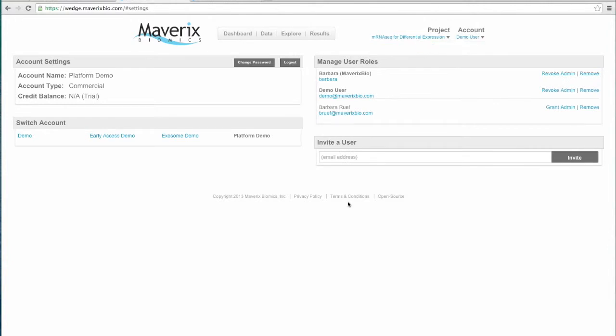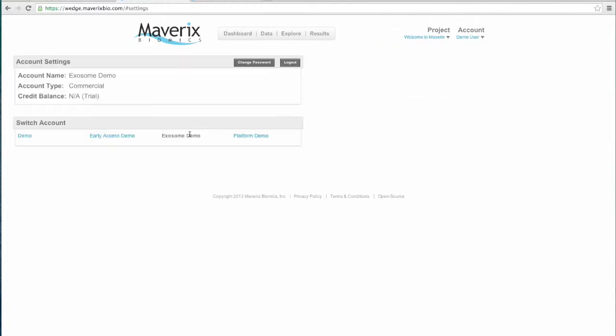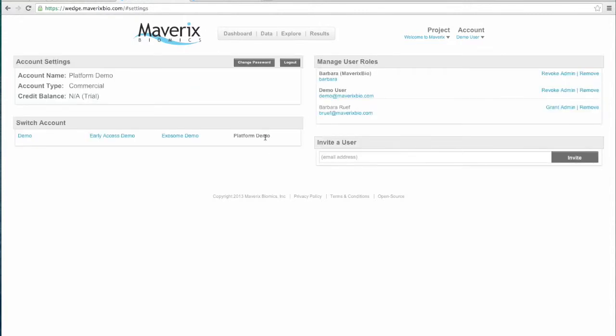If you go to the settings, you'll see what account you're in, and there's also a pane down here that shows you different accounts that you might be associated with. The average user on the platform might just have one account with their projects and analyses in them, but if you did have more than one, you would be able to switch between them right here. You'll notice that if I select this project here, the content on the right-hand side disappears. That's because within this particular account, I'm actually just a user, whereas for this platform demo account, I'm an admin within this account. So I get some additional tools over here on the right-hand side.